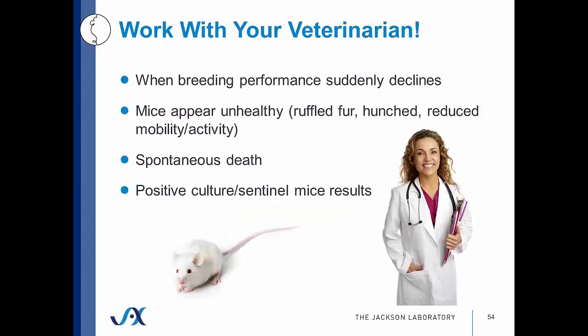We have all of these suggestions for care and housing of these NSG mice that we have used in our own facility, but we still highly recommend that you talk to your veterinarian when breeding performance suddenly declines or the mice start to look unhealthy. Also, if you start to see spontaneous death, or if any of your sentinel mice become positive for potential pathogens.